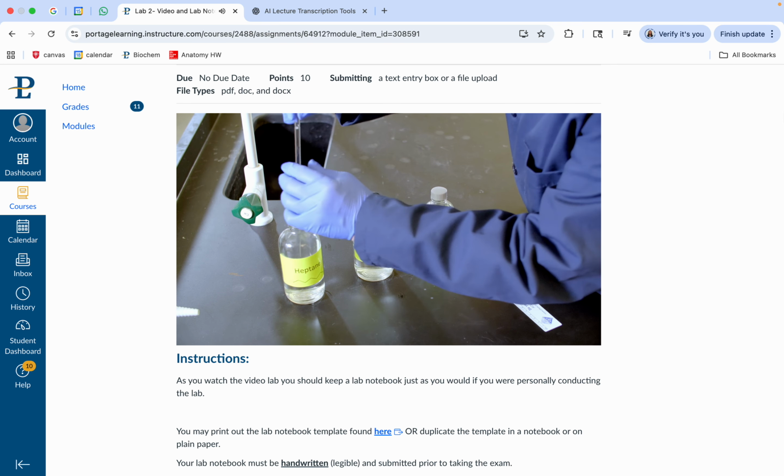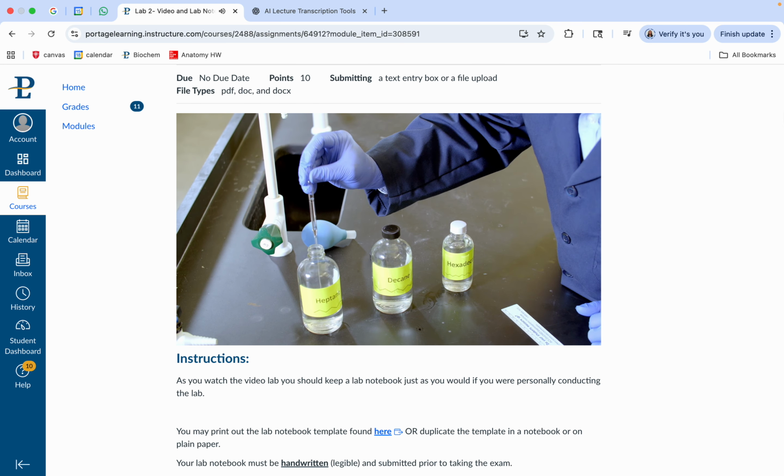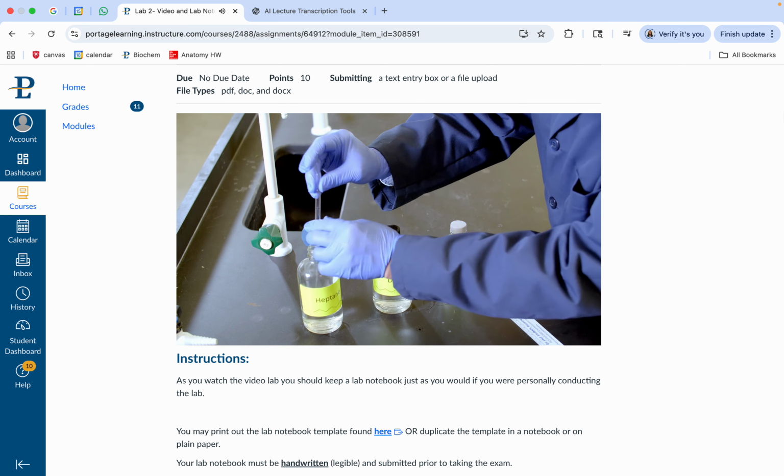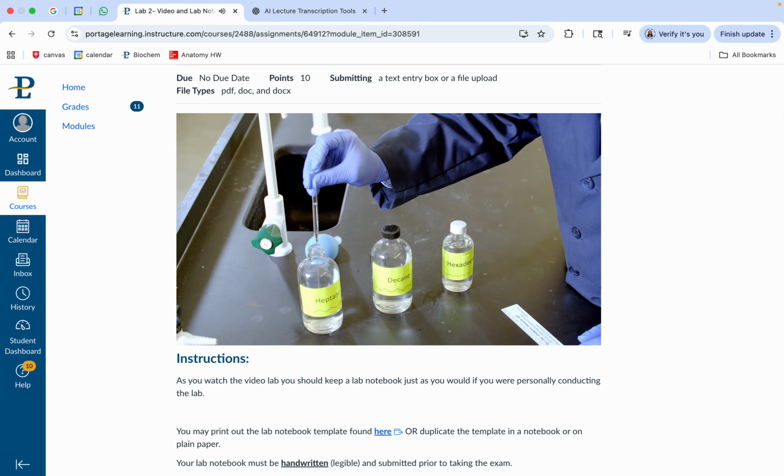So we'll start with heptane, and we'll pull up heptane into here, and I'll get it into position. It's now in position, so I'll say start, stop. Try this one again. We'll get the second one into position. It's now in position, so I'll say start, stop.